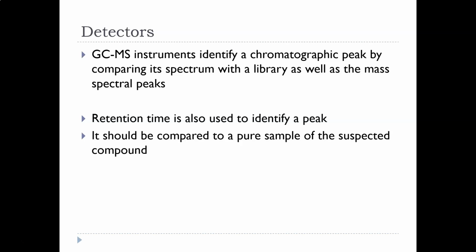So when we have GCMS instruments, GC stands for gas chromatography, MS stands for mass spectrometer. The GC component boils the sample and separates it into its components. And then the detector is actually the mass spec. The sample leaves the column and goes directly into the mass spec instrument. So in that case, the detector is a whole other instrument, the mass spec. We have the retention times coming from the GC component, but then the mass spec is making the measurement.